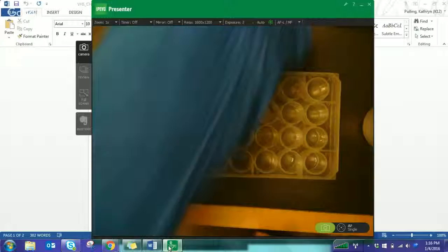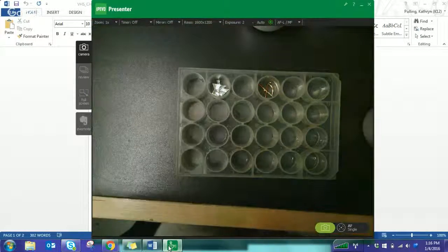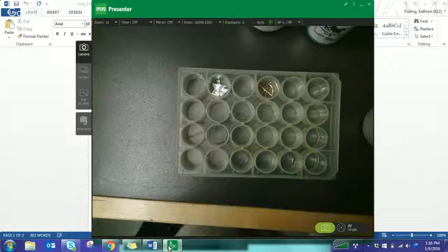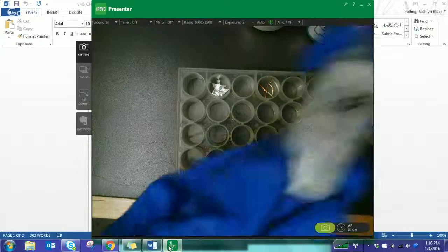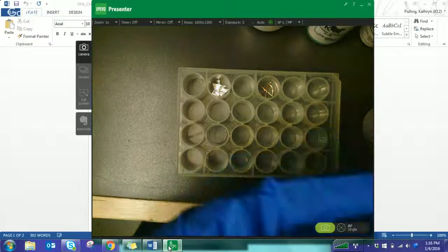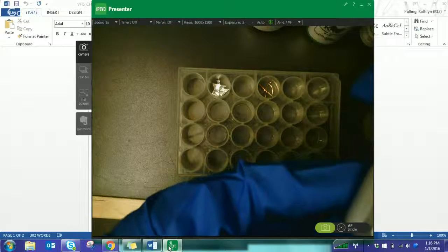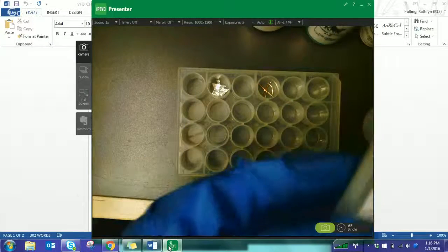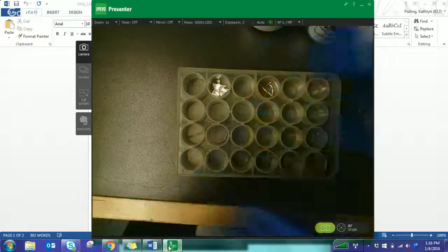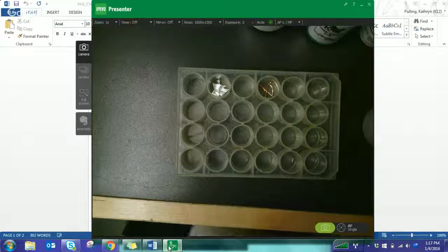And then for part 3, just so that we have all of our materials, we're going to need the well plate again. You're going to still need that silver nitrate and the copper sulfate, but we also are going to need sodium chloride, 0.1 molar. We're going to need sodium phosphate, right? So the book says dibasic sodium phosphate. The container says big sodium phosphate, but if you read really, really tiny towards the bottom, it does say sodium phosphate dibasic. That way we know we have the right thing.